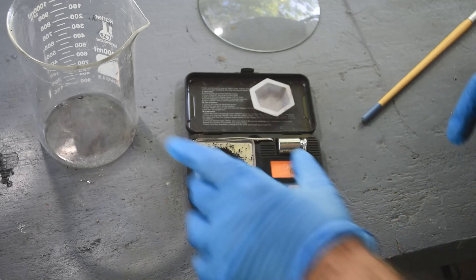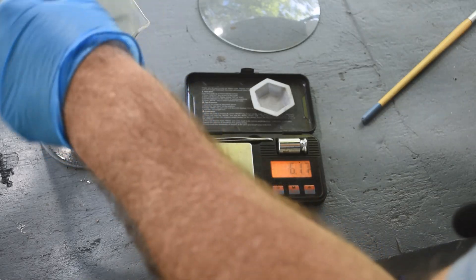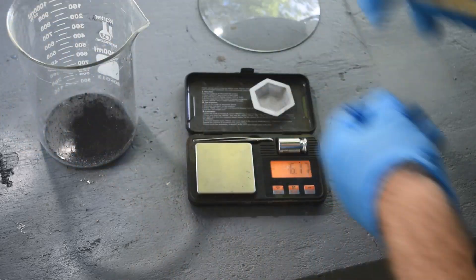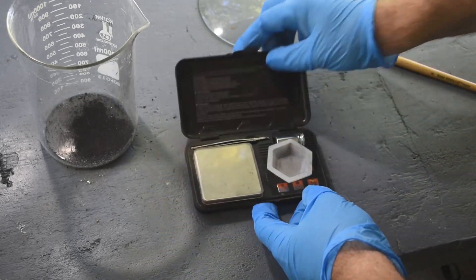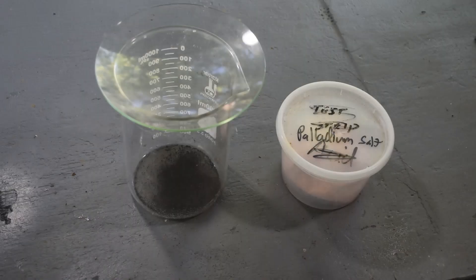So do I want to try and go after however much palladium is in this stuff — that's really the question. Or do I just want to set it aside along with the palladium ammonium chloride I've already got and wait until I have more material to process? I've given this some thought. I went away and looked at the comments starting to roll in on episode four, and here's my thinking.